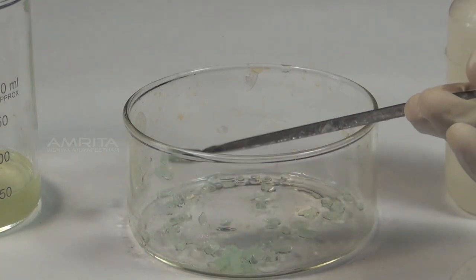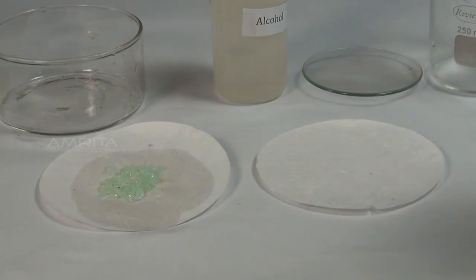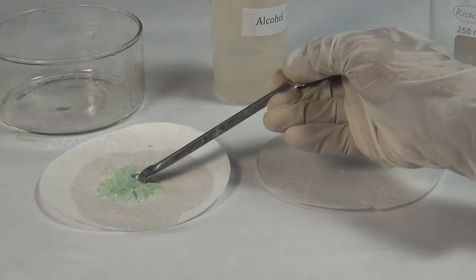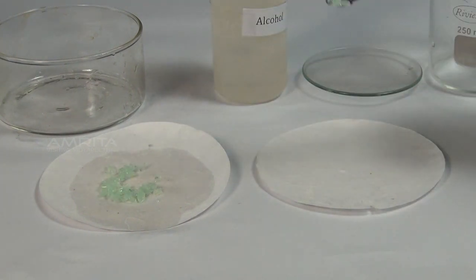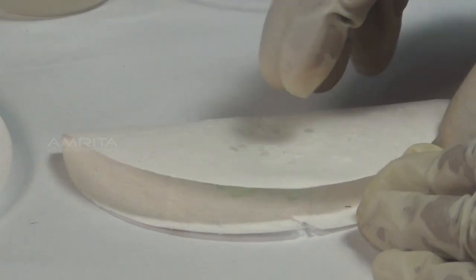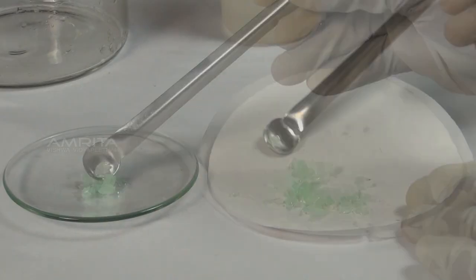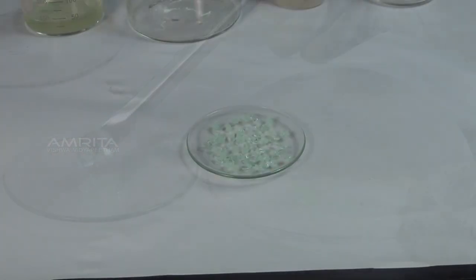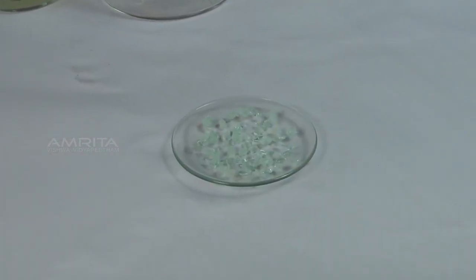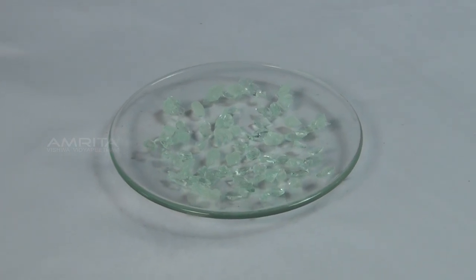Using the spatula, remove the crystals onto a filter paper which soaks the solution. Transfer the crystals onto another filter paper and dry them by pressing gently between the folds of the filter paper. Now transfer the crystals into a watch glass. The crystals of pure ferrous ammonium sulphate are pale green in colour and are monoclinic in shape.